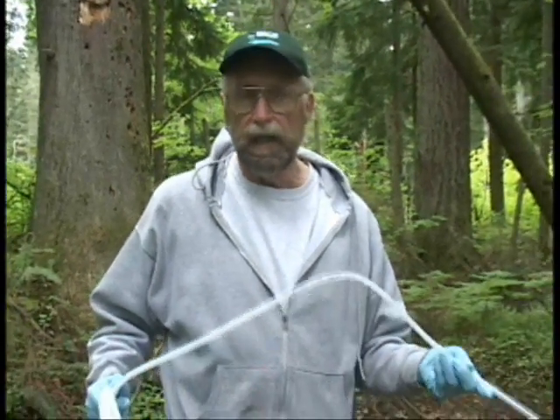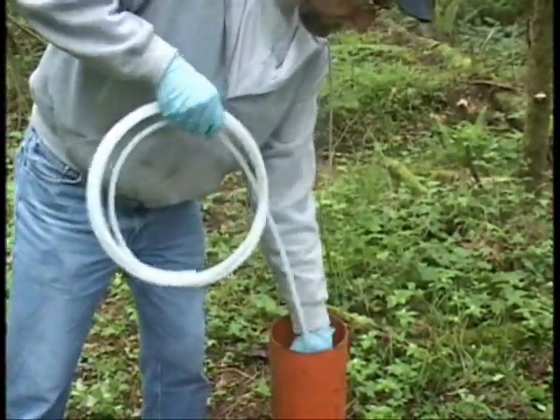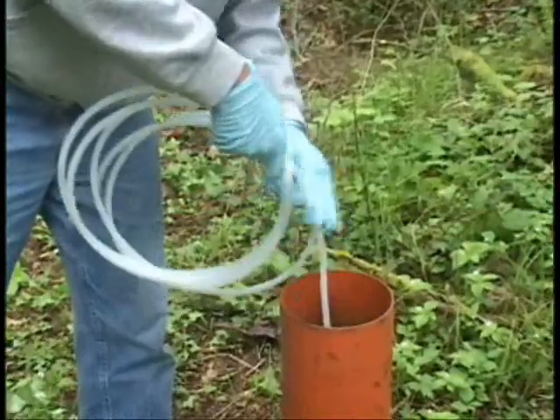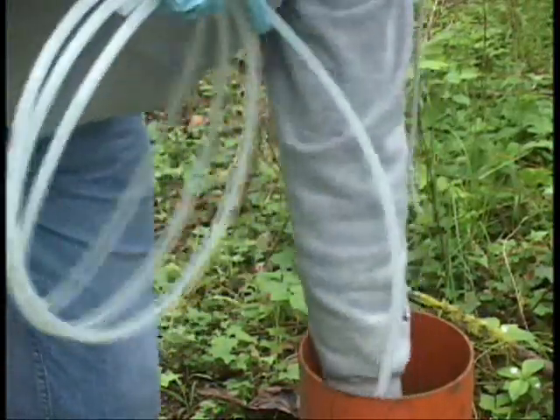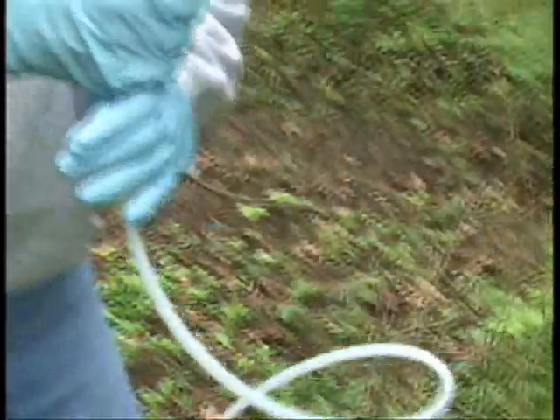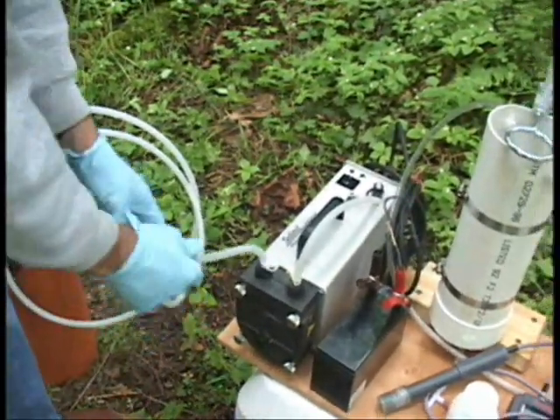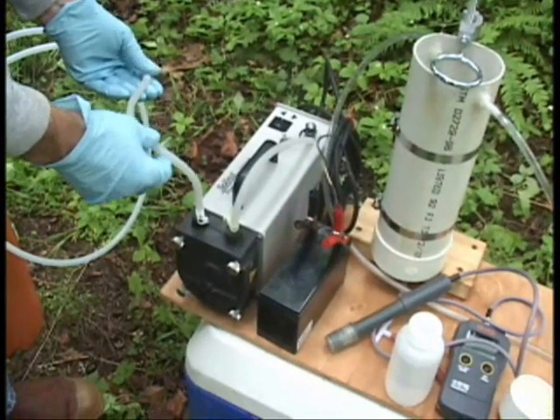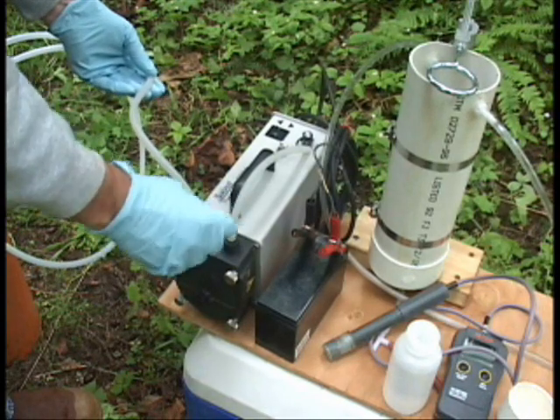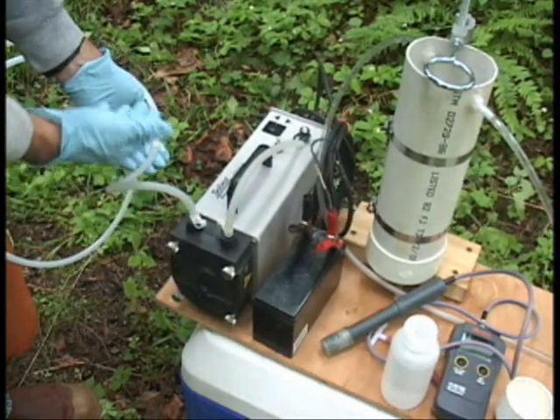Now we're going to insert our tubing into the well and put it about a foot or two below the water level surface. We're going to hook the tubing to our pump — this is the suction end of a peristaltic pump. What this peristaltic pump does is provide a negative pressure as it deforms this flexible tubing, and there's a rotation within the pump head that will bring water to the surface through a vacuum.